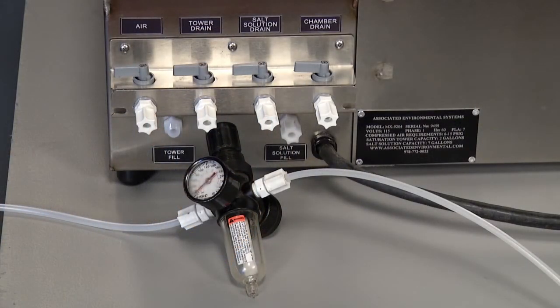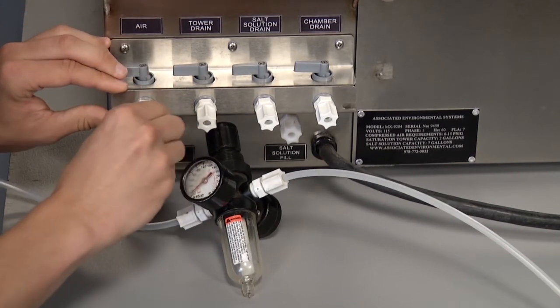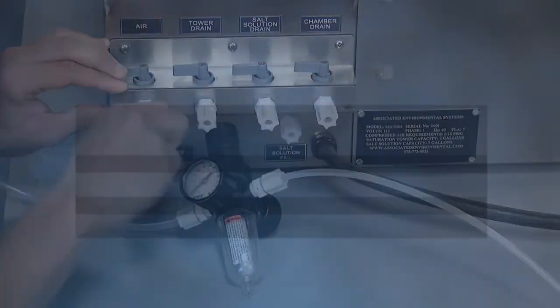MX series chambers need clean, oil-free, and regulated compressed air. The chamber has been furnished with the valve marked air at the rear end of the chamber. The compressed air requirements for the MX-9200 series are as follows.